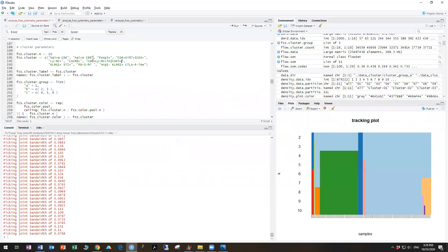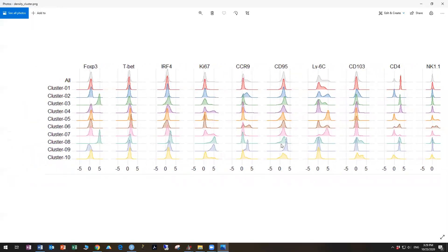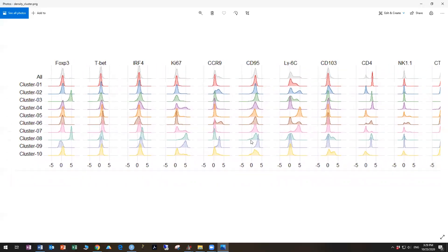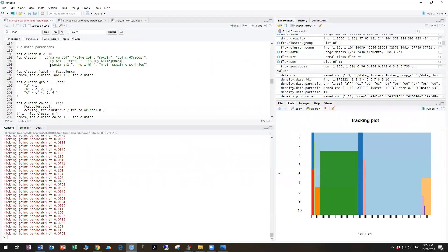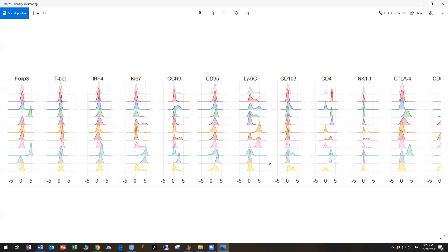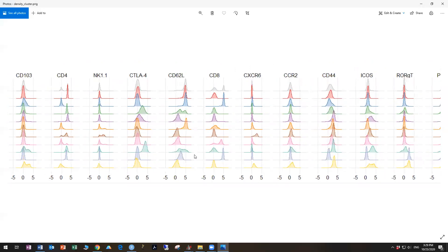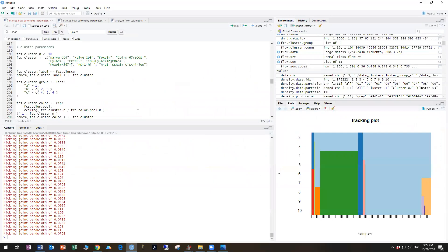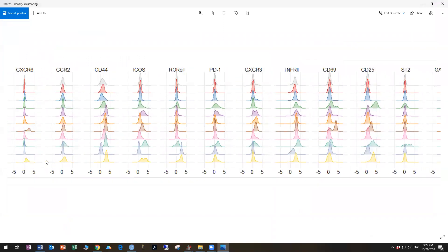We just did seven, so eight. FOXP3 positive again, KI67 positive. Nine KI67 positive. CD8 positive.